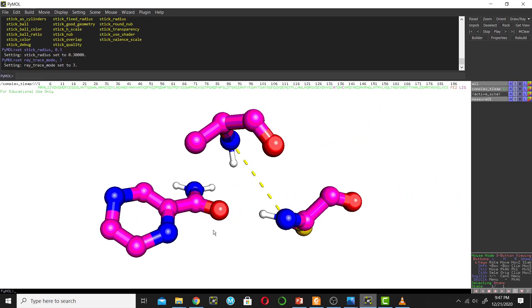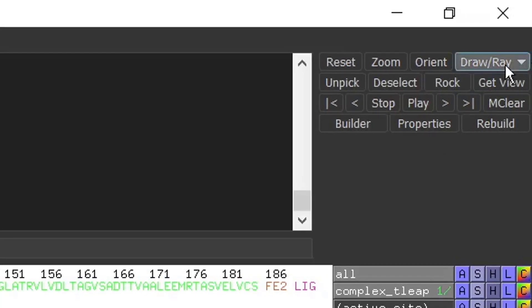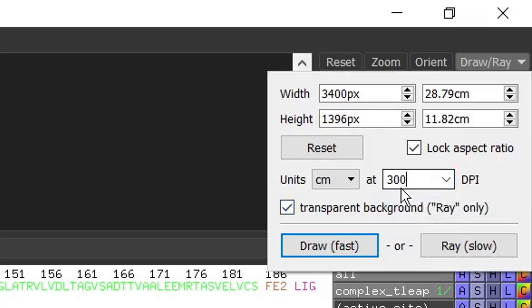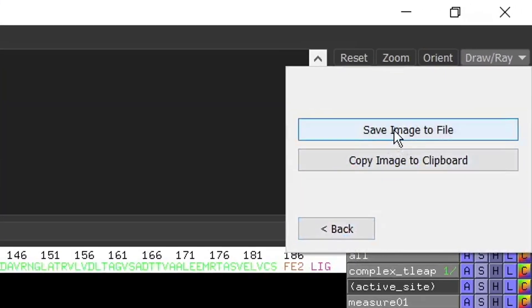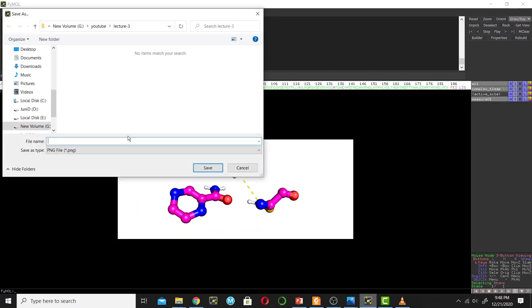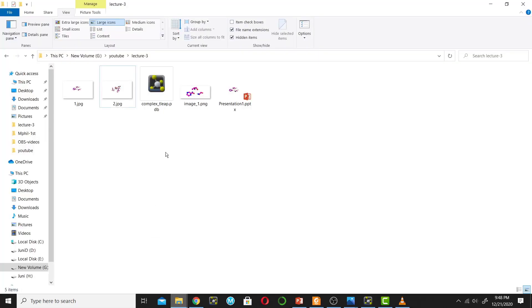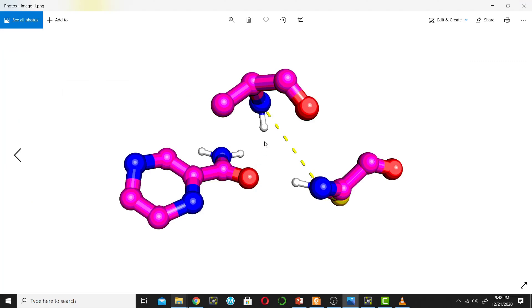Now we will save this picture. Go to the Draw/Ray button and click Draw. Change the DPI of the picture to 300 — this is the publication quality DPI for images. Then click Draw first, and then Save Image to File. Give the image a name, for example 'image1', and save it. Now I have created this beautiful picture.